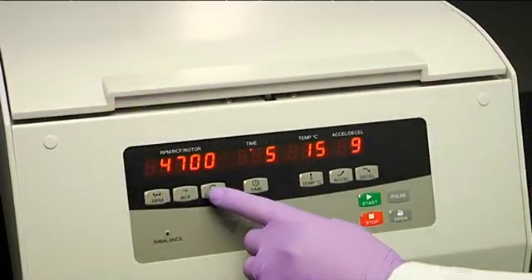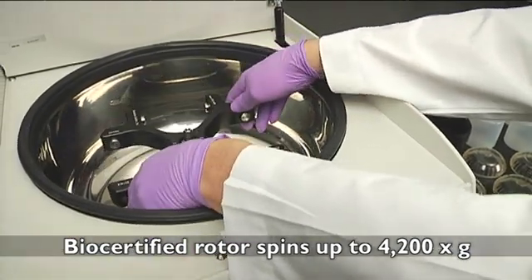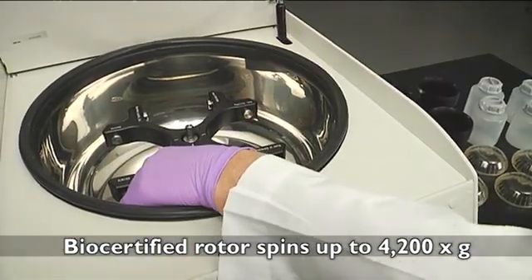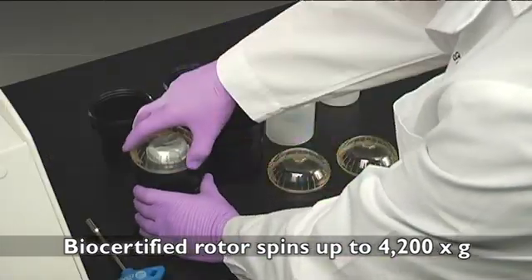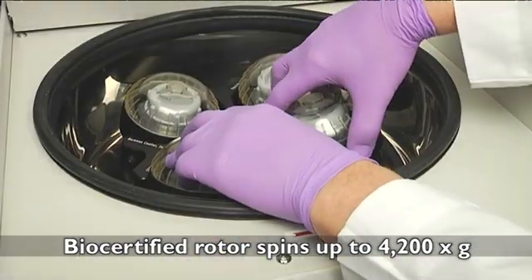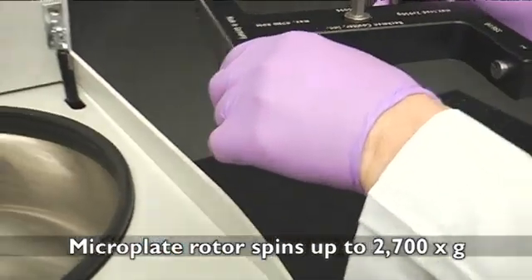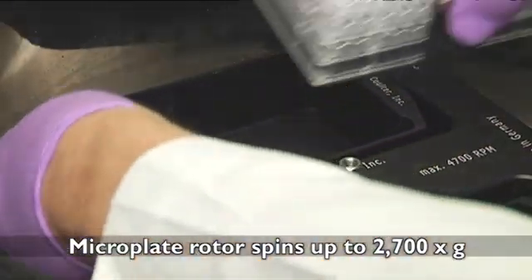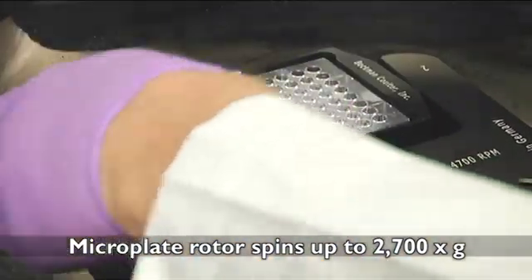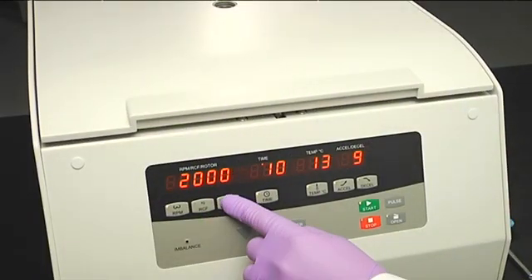The Allegra X30 also showcases an enhanced rotor library. To help deliver safe operation, the SX4400 Swinging Bucket Rotor is bio-certified and offers 400 milliliter bottles that can operate at speeds up to 4,700 RPM and over 4,200 times G. And the S6096 rotor spins microplates up to 4,700 RPM and over 2,700 times G, allowing for a wider range of applications that require high G-forces and more efficient cycles.